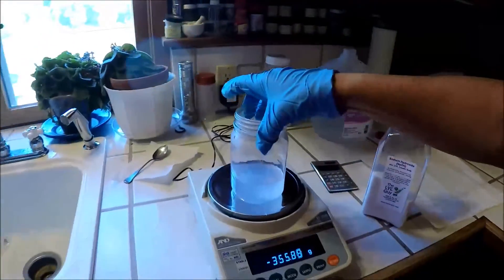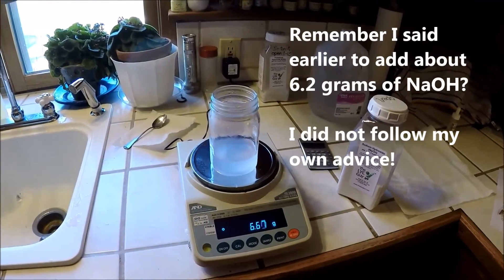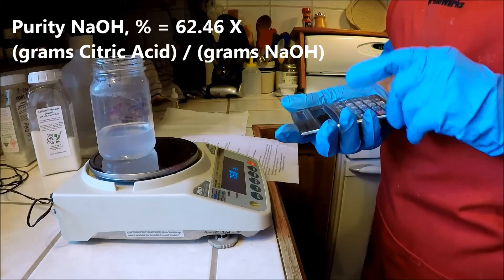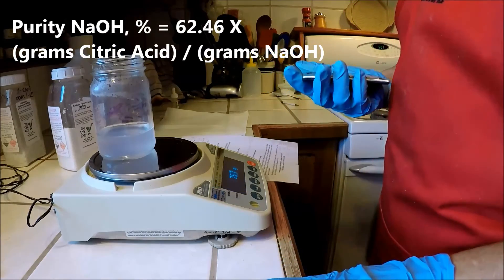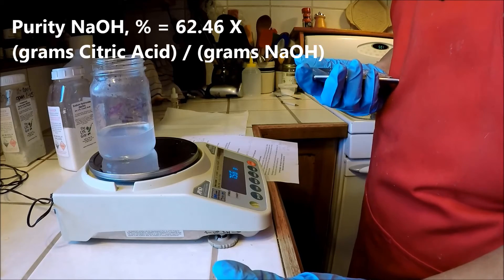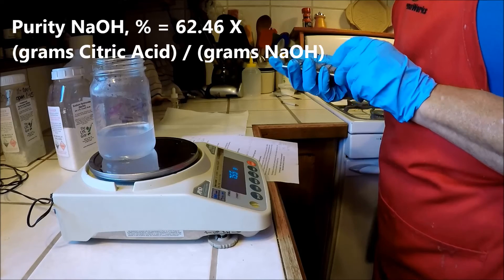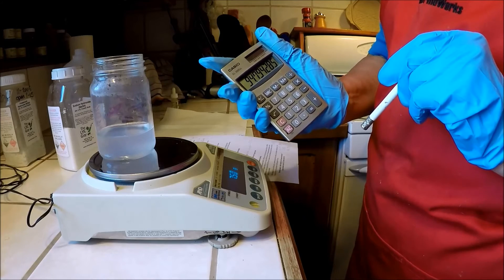Let's check and see what the weight is — 6.67. I overshot my first amount of sodium hydroxide, but I got pretty close. Based on Kevin Dunn's formula, the sodium hydroxide purity is equal to 62.46 times the grams of anhydrous citric acid used, which was 10.07 grams, divided by the grams of sodium hydroxide actually added to the water to turn it faintly pink, which was 6.65. So I have about 94.8% pure sodium hydroxide.